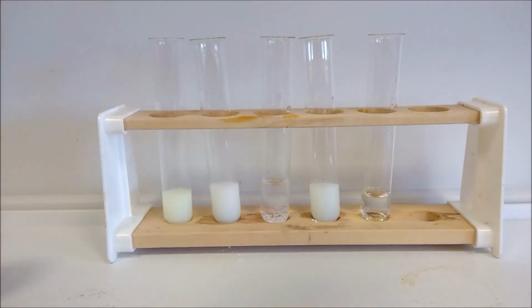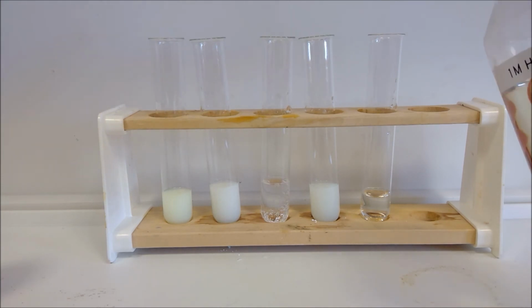So we know what we've got in each of these already, so we don't need to continue any tests on those. And it's important when you're carrying out analysis experiments not to continue doing unnecessary tests to minimise the amount of chemicals we used and to reduce any risk as well. So we just do the minimum number of experiments required to positively identify our compounds there.